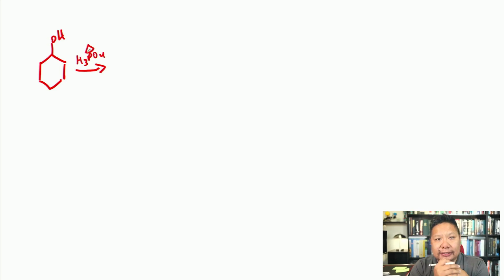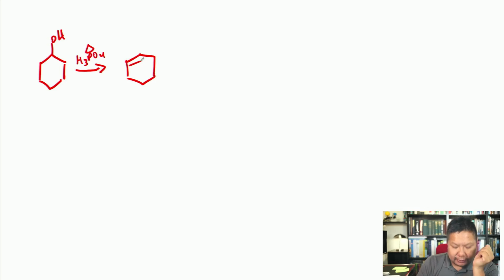Some people write out the word heat, some people put a triangle there, whatever it could be. And what you're going to get from that is cyclohexene. So literally this is a dehydration reaction, and we talked about this ad nauseum in the alkene section of our lecture.